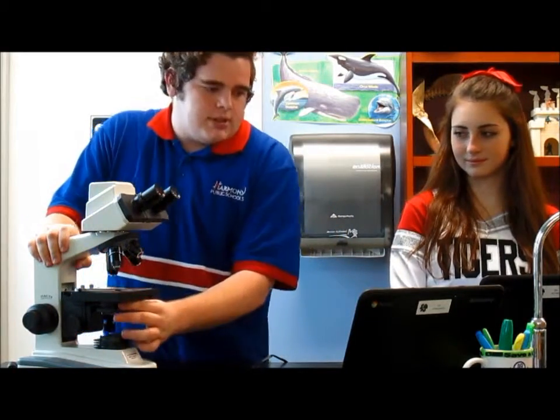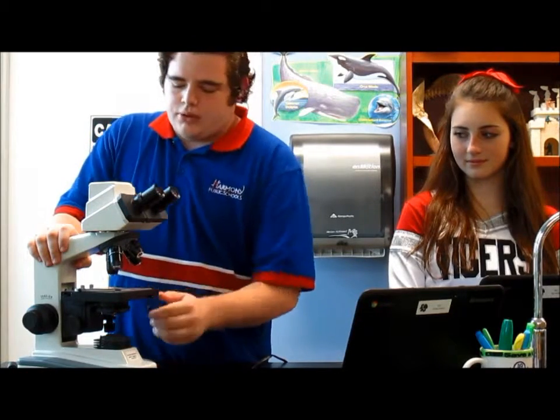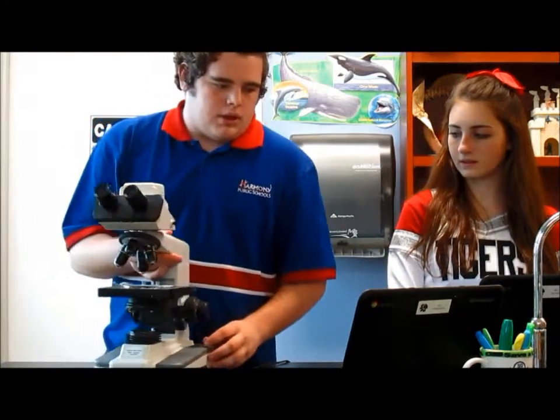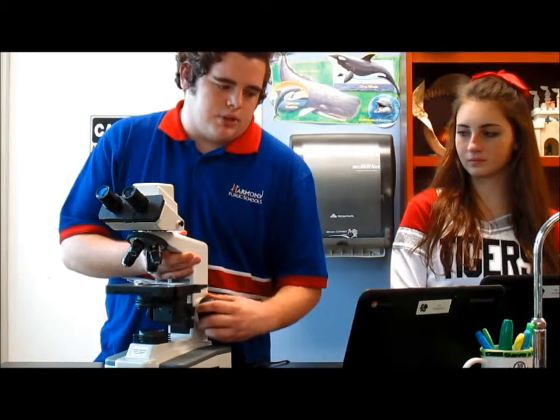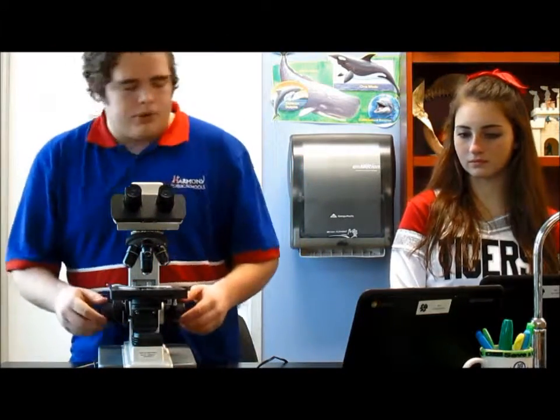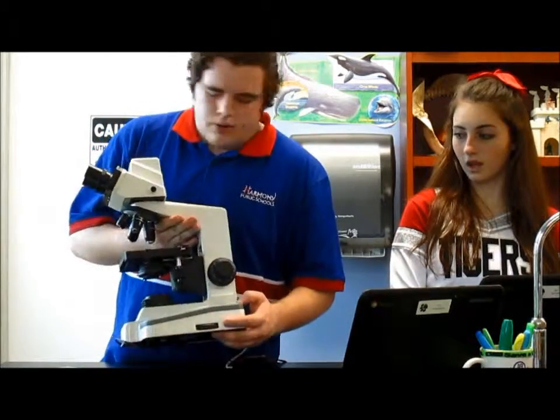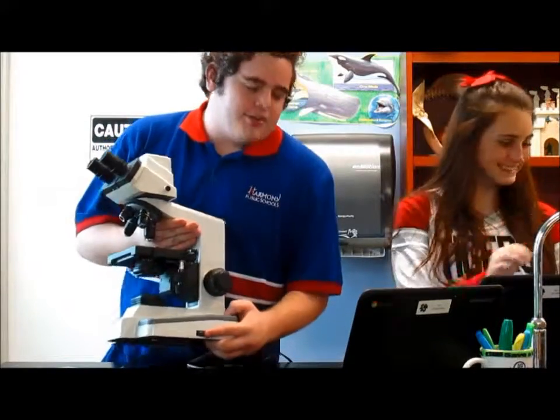The iris diaphragm, the mechanical stage that you move around, of course. The coarse focus, you make it go up and down so you can get a better focus on it. And then the fine focus on this one is on the sides also. And then on the very bottom right here is the variable intensity control.